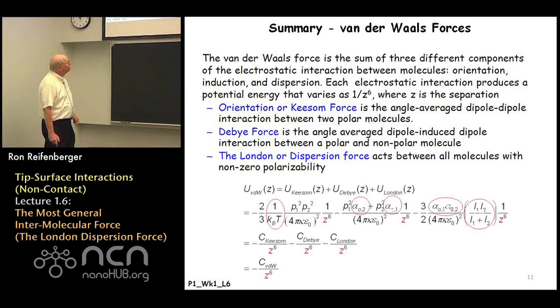And the sum of these 3 interaction potential energies, they're referred to as the Keesom, the Debye, and the London interaction potential energies.